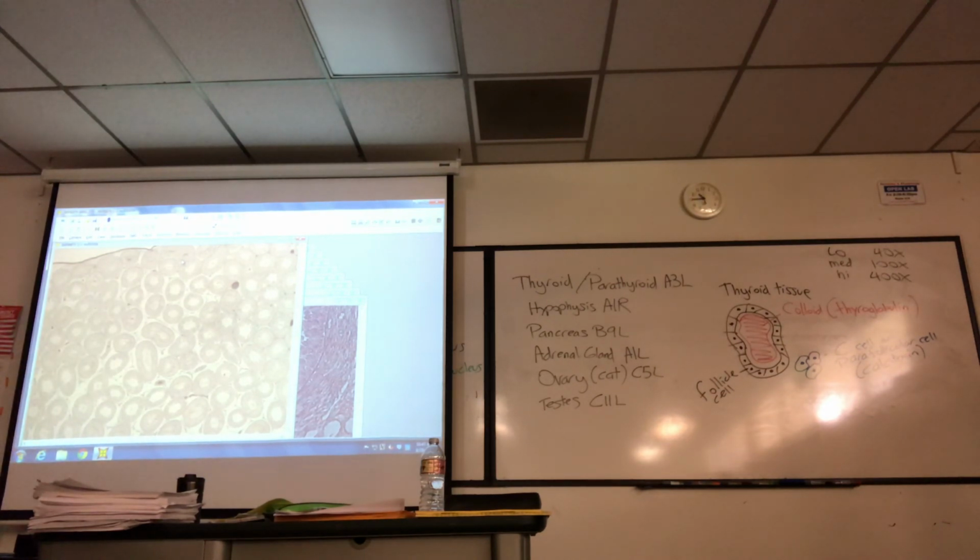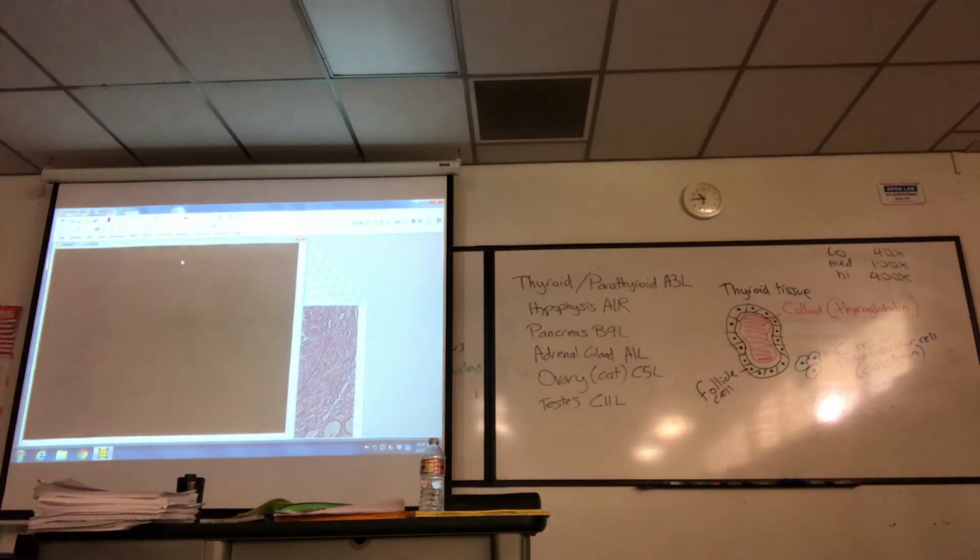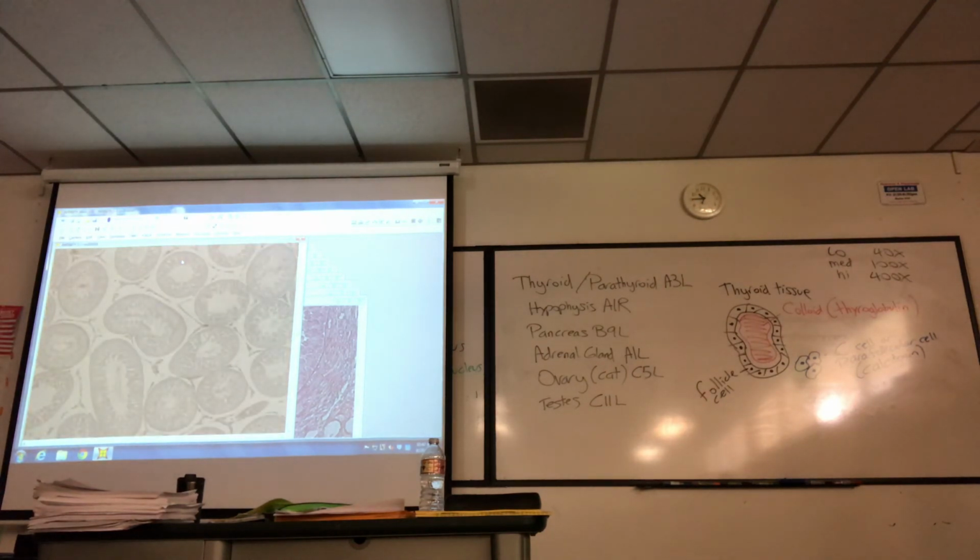So let's go to a higher magnification. This is 40. Here's 100. Let's go to 400.